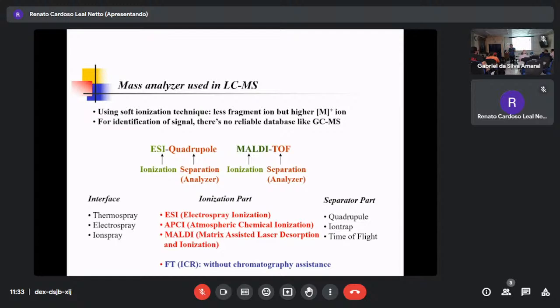But if there is some infection, now you are interested where, if it's a leaf, and some part is infected, what I'm interested in is that part. In that case, you can use this kind of imaging. But as he mentioned, any kind of imaging technique is still a quantitative issue.